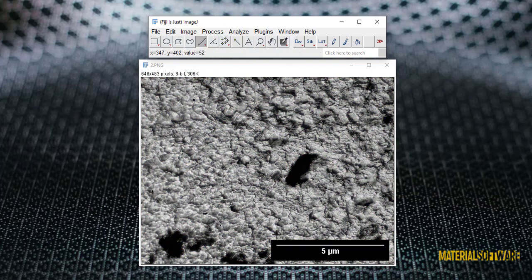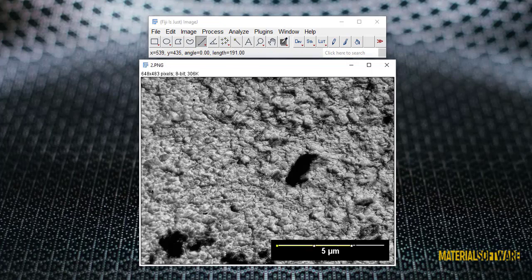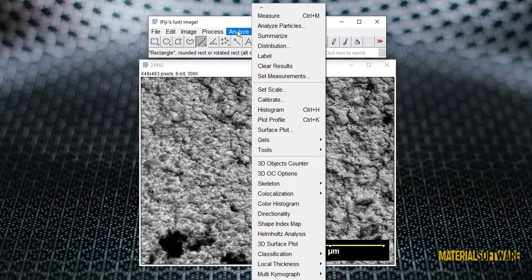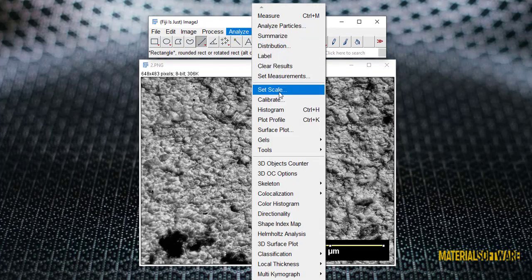Next, we calibrate the image by selecting the line in the menu and holding the shift key on the keyboard to draw the line. Image calibration training is described in detail in the training part of the software.